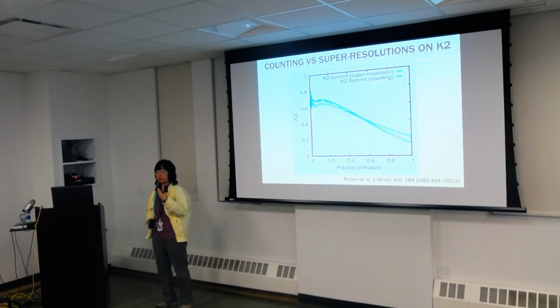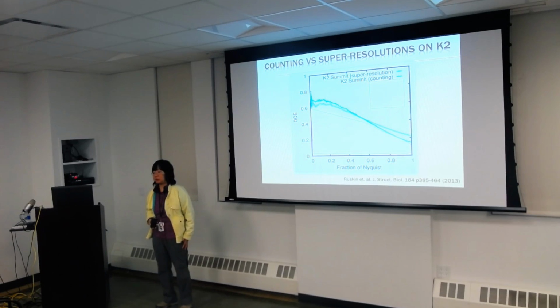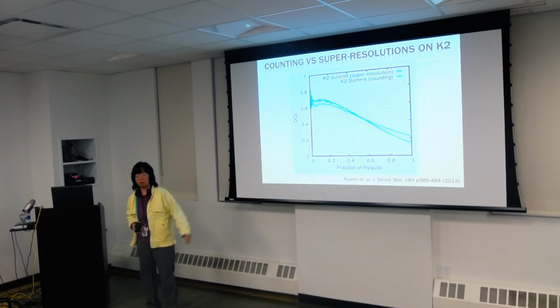But the reason people are saying you should use super resolution is because aliasing is a mathematical effect that you know is there, so you try to do what you can. That's basically what it is. Where is the low resolution part coming from? That's a really good question. It shouldn't be there because you don't get high frequency information that far out to actually impact. So maybe their calculation wasn't quite right. If I correct that properly for a counting mode, maybe my counting mode would actually look better. So it's a little tricky to describe. Okay? So that's advanced Fourier transformation for you.